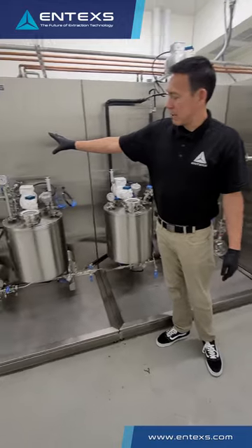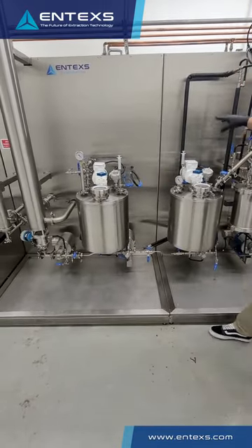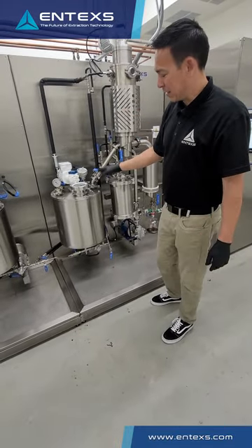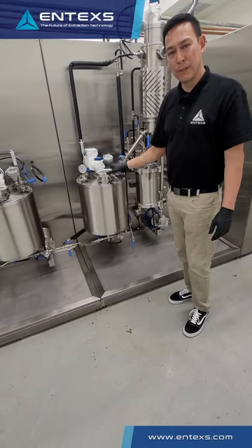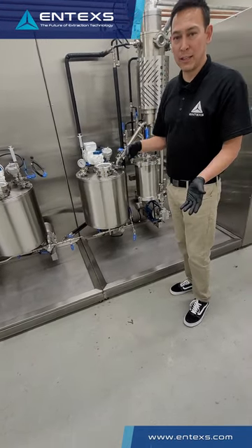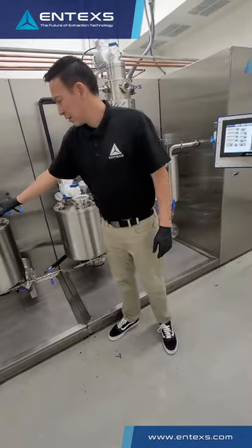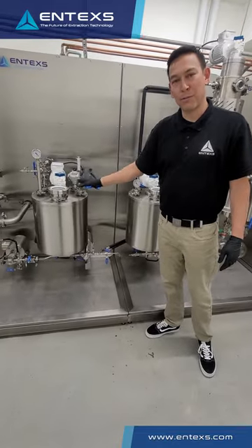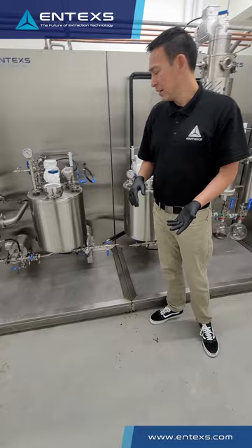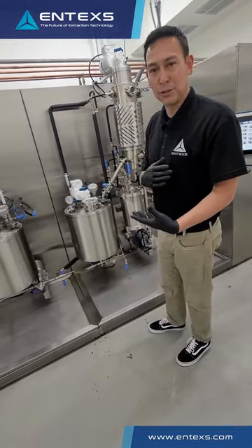When mated with the Entex evaporation system, this allows you to push product directly over in a first-pass condition to strip your lights off and send it back into the wiped film feed tank, so you don't have to do it over the floor. That's very important for product loss and product quality. This also allows you to not have to use rotovaps, bake ovens, or other lab-scale processes traditionally used in this industry to pull off residual solvent.